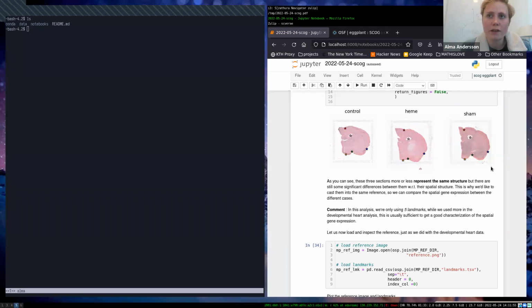I think you could probably identify some differences, perhaps that aren't super obvious. For example, maybe if you do a factor decomposition and want to transfer the factors instead, maybe there's some difference there. And maybe if you do this fast approximate transferring of the full transcriptome, you can make something that I mentioned before. So like this unsupervised analysis, trying to identify genes that actually have differential gene expression with respect to their spatial structure. So I think definitely that's something that's worthwhile doing.